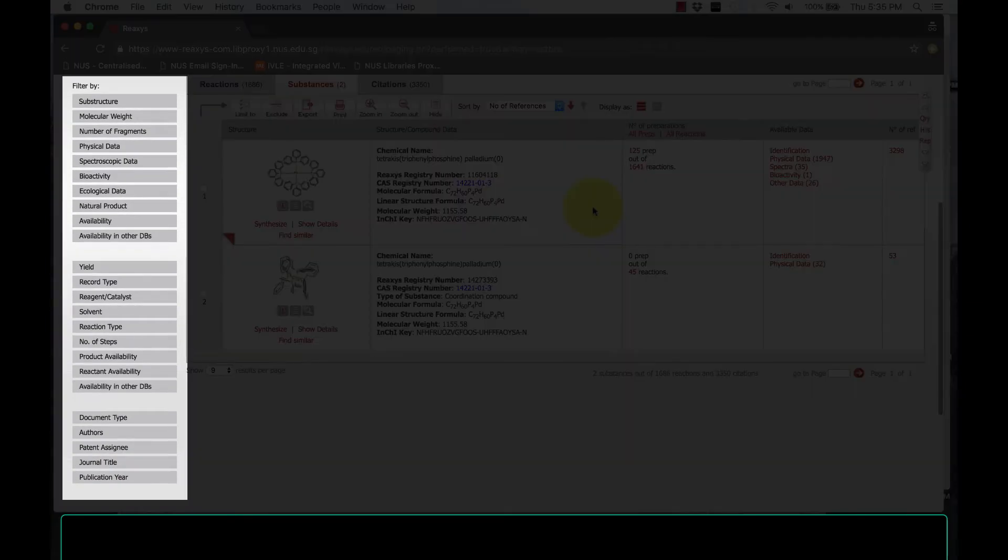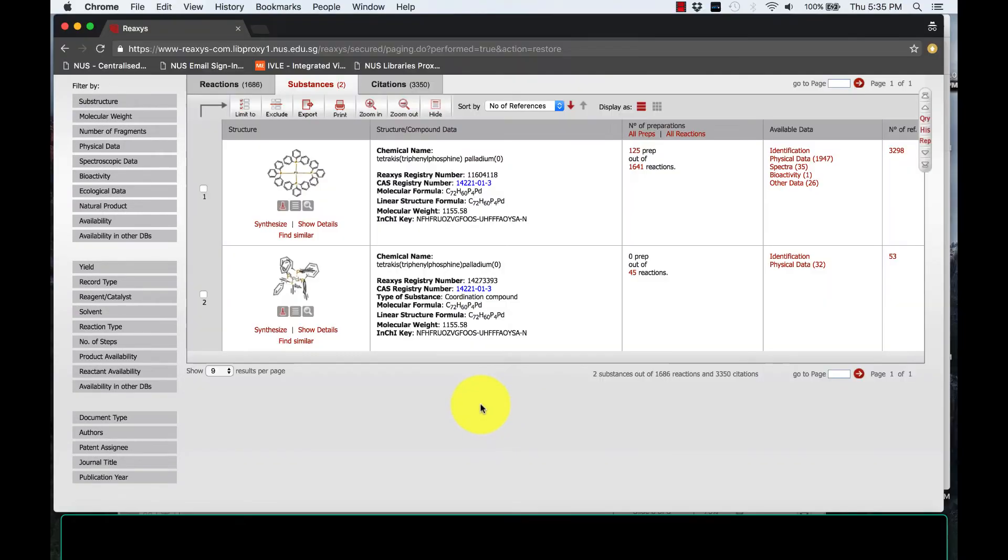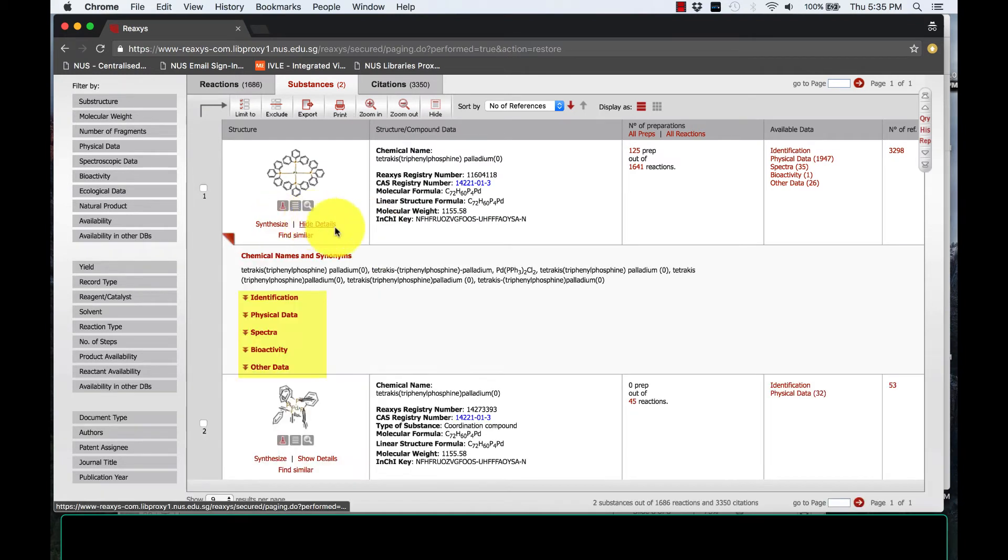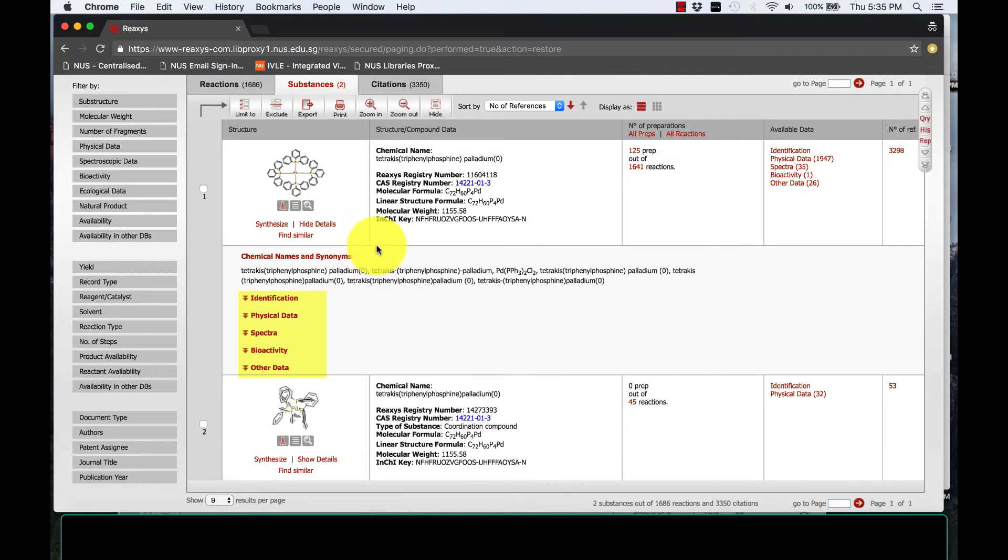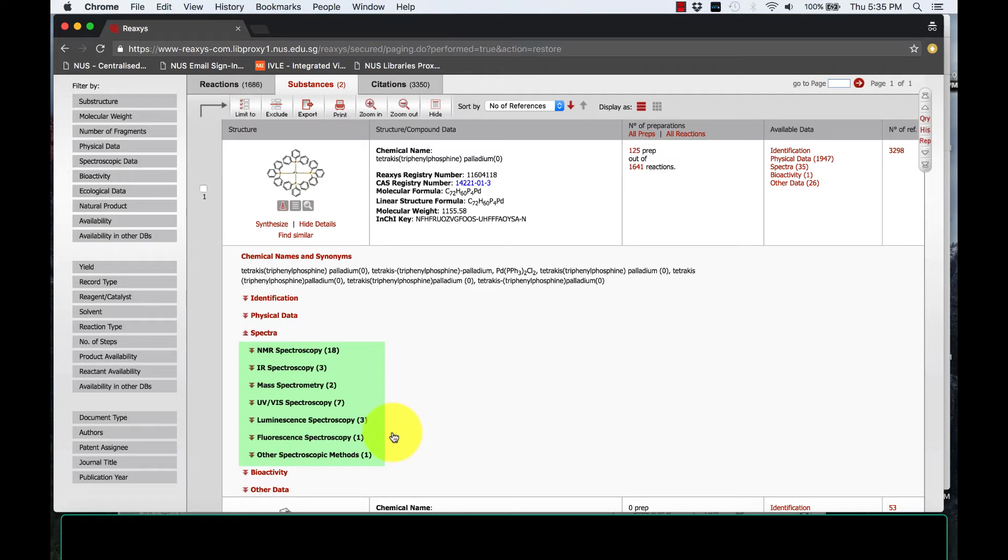You are able to filter your search further accordingly until you retrieve your final compound. We can start looking at information about this compound by clicking Show Details and they will show you the available data from the database. One useful information you can get from this is that REAXIS provides various spectroscopy data too. Thus, you may use this to compare with your experimental spectra.